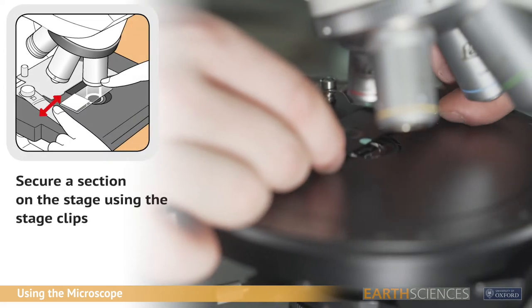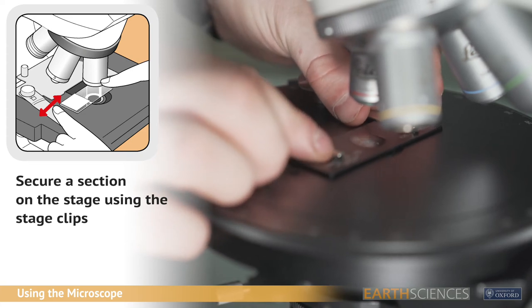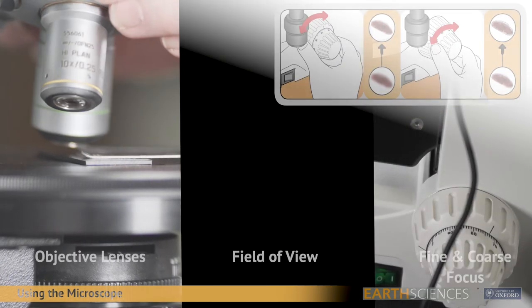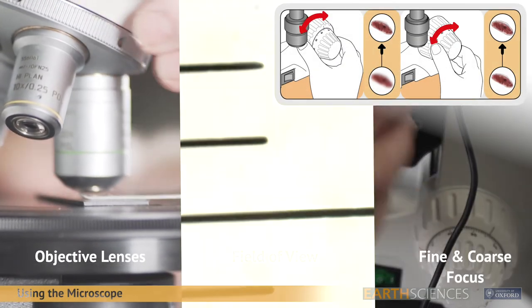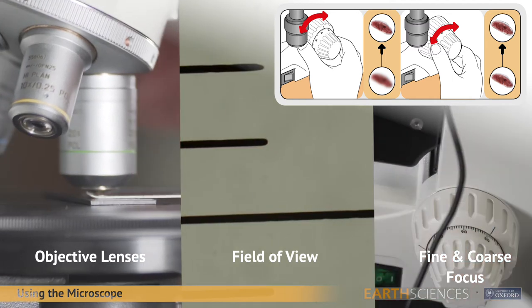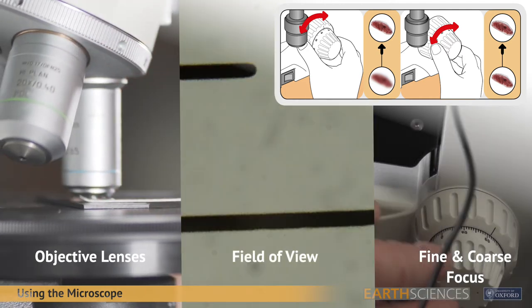Place a section on the stage and fix in place using the stage clips. Use the coarse and fine focus knobs to focus the image as much as practicable, working up to at least 40x magnification. Only the fine adjustment should be required once you have established focus at lower magnifications.